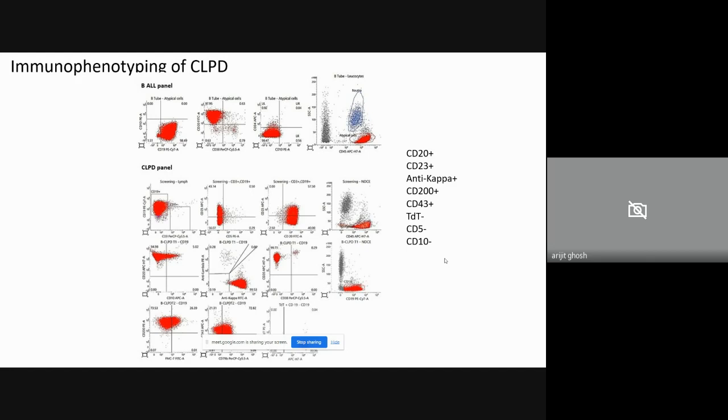And in flow cytometry, every single cell is being analyzed. So the small dots in the dot plot are representing every cell you are running in the machine. That is why this technique is very accurate. Another advantage is that this is a multi-parametric method.